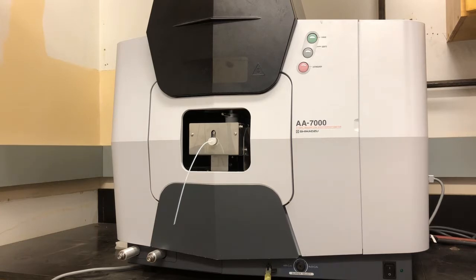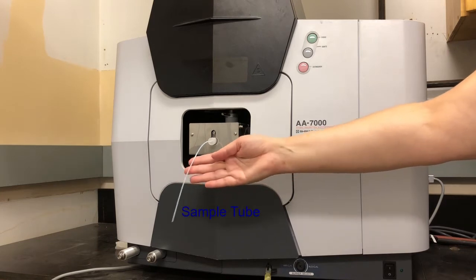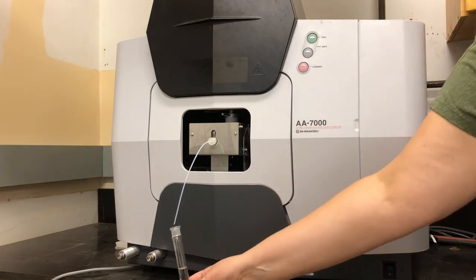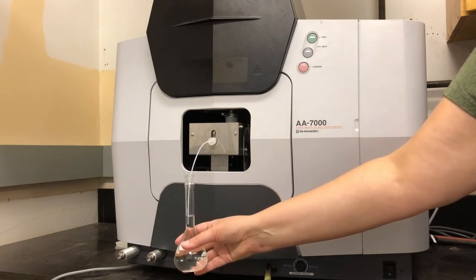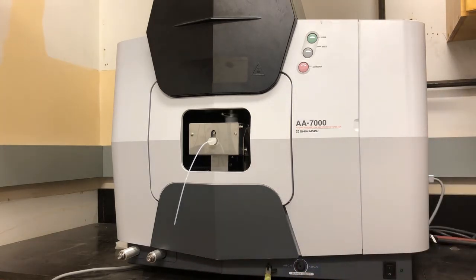So the first thing we need to know is how to get the sample into the instrument. The sample enters via the sample tube right here. This is very delicate, so you want to be very careful when handling it. We simply take our flask containing our sample or our standard, and we gently place the tube in the sample under the surface of the water, and by capillary action it is taken up into the instrument. So the sample enters the nebulizer, which vaporizes the liquid. It evaporates off the solvent, and then the atoms enter the flame.